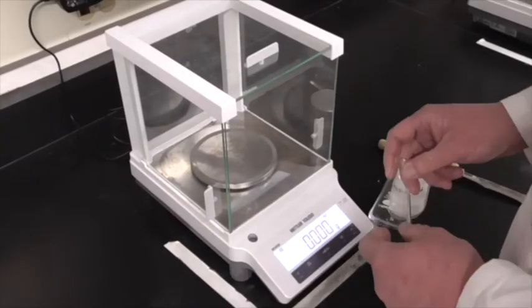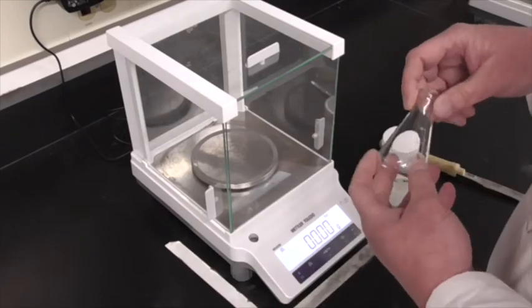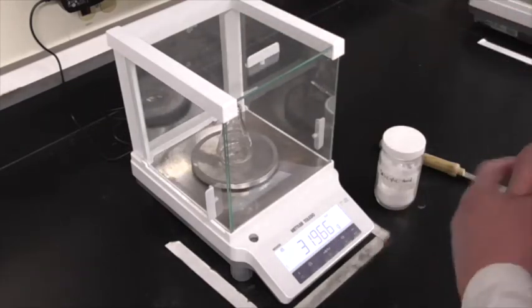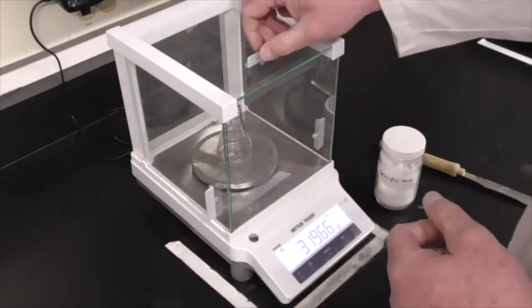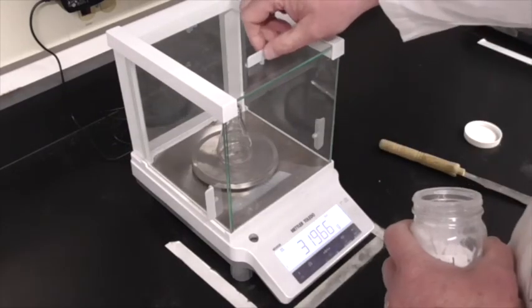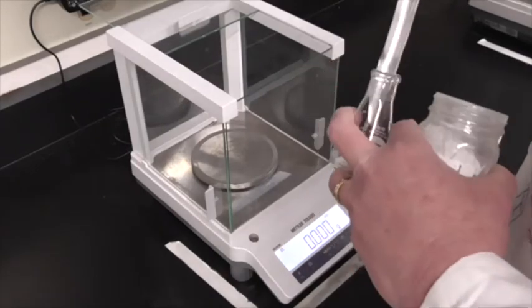So here at the balance, we have our flask, we have our salicylic acid. We need about 2 grams of this. And I'm going to do this by difference again. I'm going to weigh the flask, and then we will add 2 grams of salicylic acid to it and get the total mass of the two. So the flask has a mass of 31.966 grams. That means we're going to need a little bit under 34 grams total to get 2 grams of salicylic acid in there.